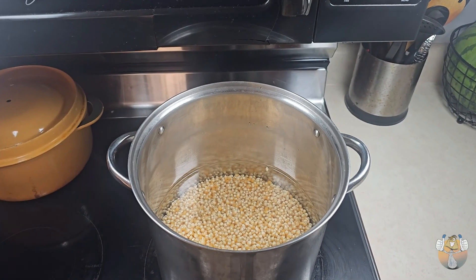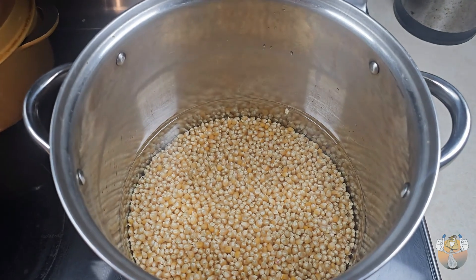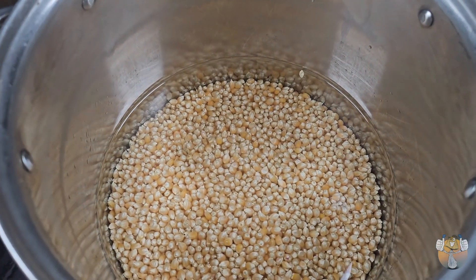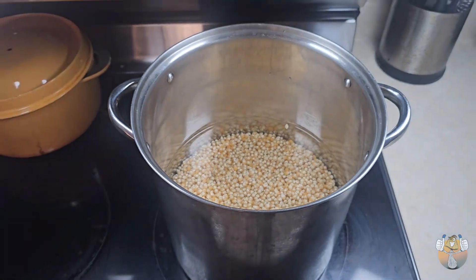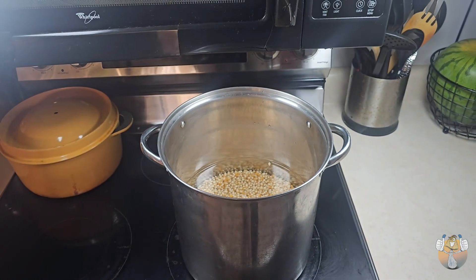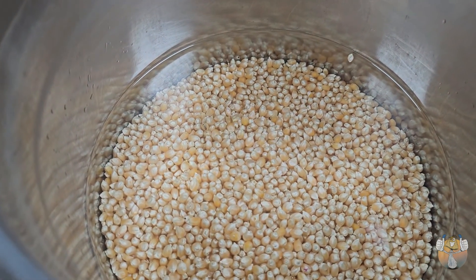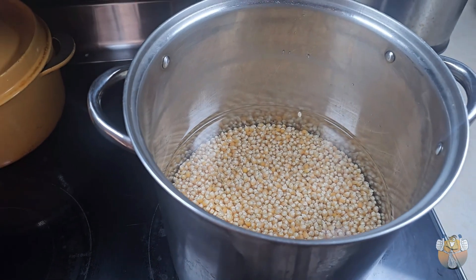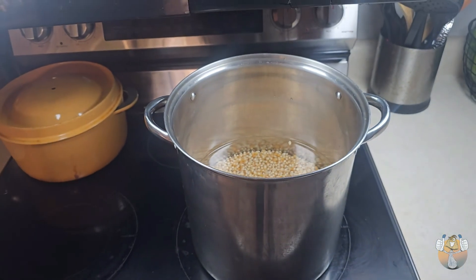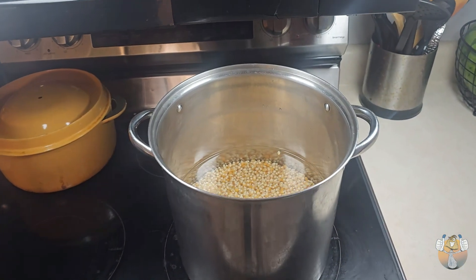What's going on, shroomies and shroomettes, it's your guy with the fungi, Easy Blue Thumb, and we are back with another one. Today's video we are starting our Popcorn Chronicles, so we are preparing our popcorn for our pressure cooking. Let's get it, let's go.